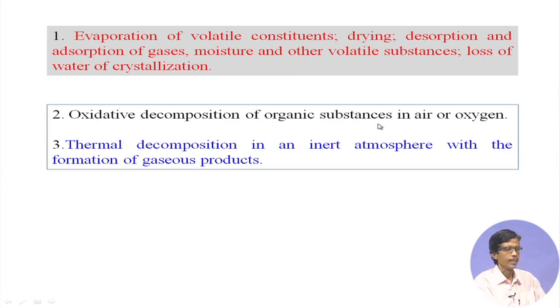But when we put this in an inert atmosphere like nitrogen or argon, sometimes we should take only argon in lieu of nitrogen, because at very high temperature we can have reaction with the nitrogen, since metal ions can form nitrides, or in the presence of more oxygen they can go for nitrates or nitrites also.